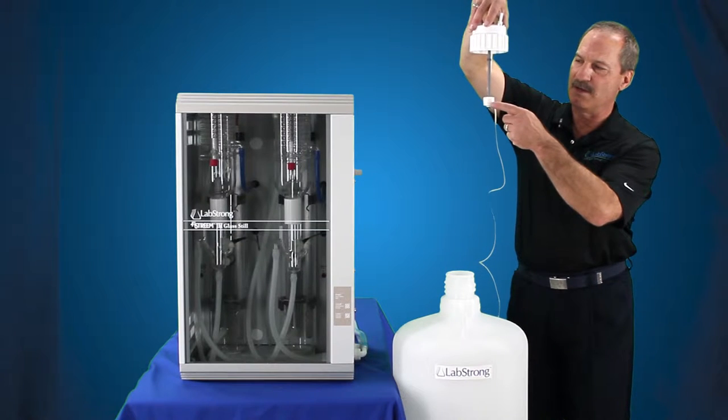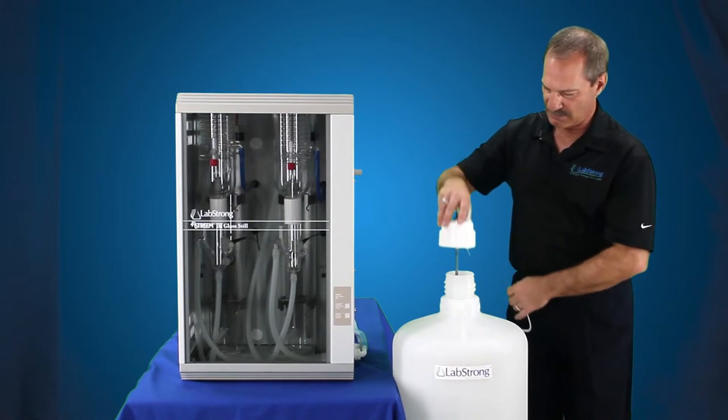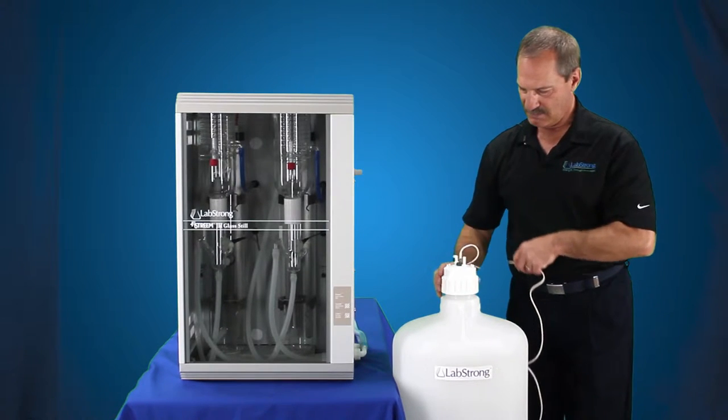This is the position when it needs water. This is the position when it's full. So we're just going to put that back into the tank and tighten that down.